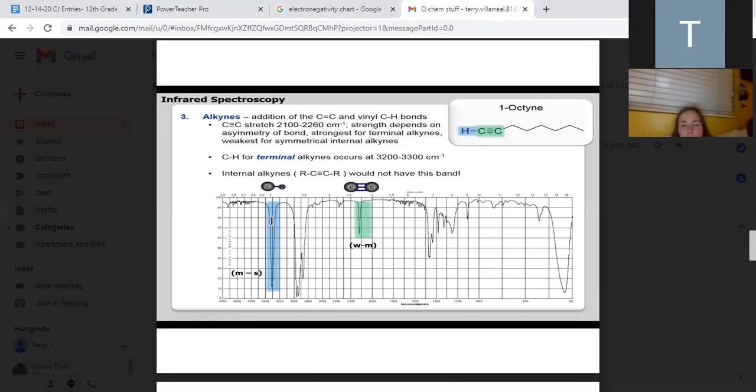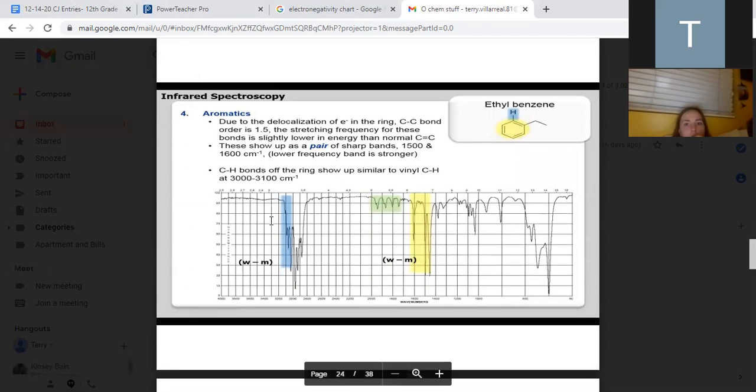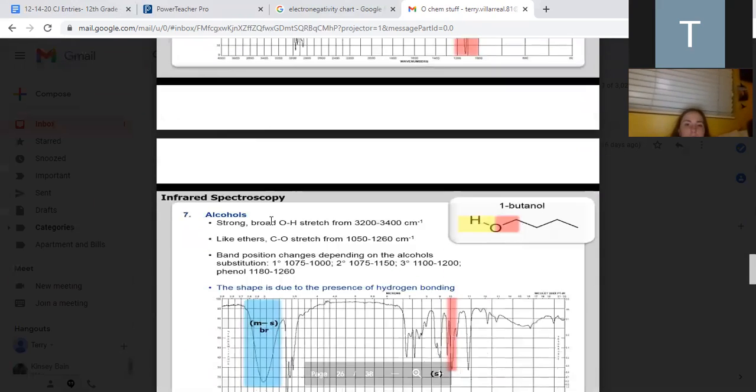Most likely. Yep. And then you have carbon-carbon double bonds from things like benzene. And then you have ethers. If you look at ether, it's down in that fingerprint range, so that doesn't help you at all. Some things like ethers are pretty much useless because they just will not help you at all.